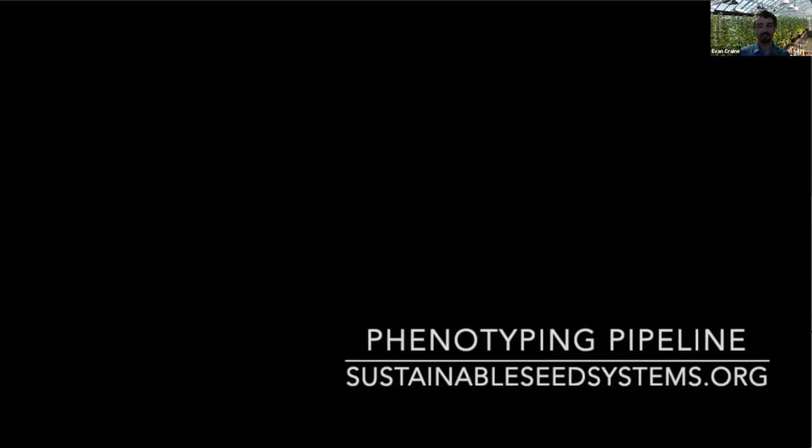So with that, I would just like to quickly say that post-harvest phenotyping will really depend on how you define it. And I showed a lot of the process in our pipeline that integrates technology, and you can still accomplish a lot of post-harvest phenotyping with basic tools. So you can use a ruler to capture seed size, you can use calipers to look at seed width or the major and minor axis. You can use just visual cues to phenotype color. And so don't be discouraged if you see this and you think you need all this technology in order to do post-harvest phenotyping. You can still accomplish it with basic tools. We've just added technology to help increase our throughput. And we're very fortunate to be able to do that.